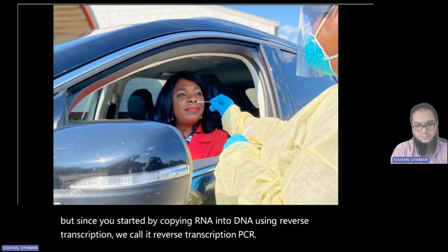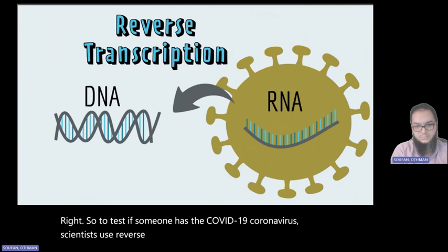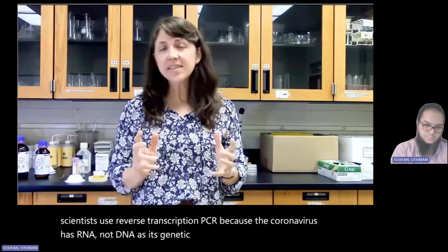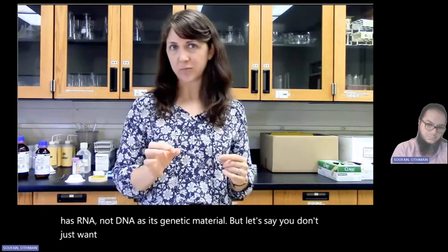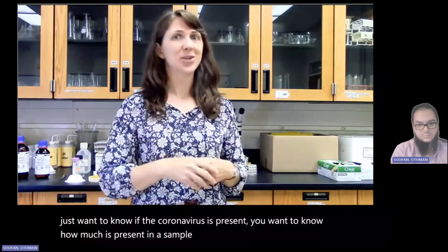Right, so to test if someone has the COVID-19 coronavirus, scientists used reverse transcription PCR because the coronavirus has RNA, not DNA, as its genetic material. But let's say you don't just want to know if the coronavirus is present, you want to know how much is present in the sample. That's where real-time PCR comes in.